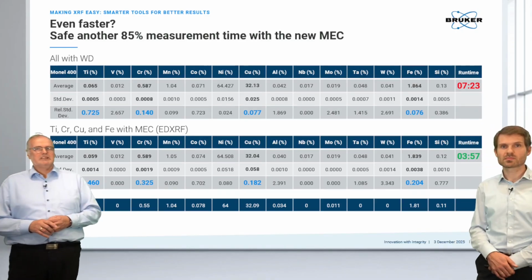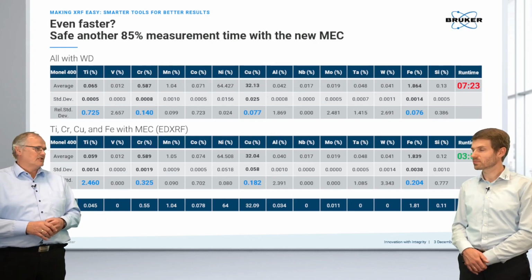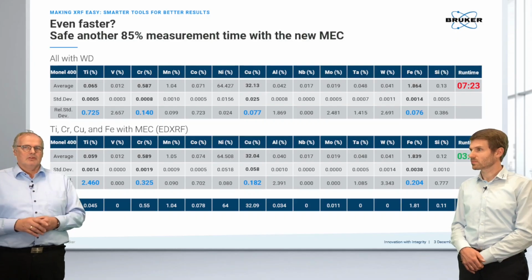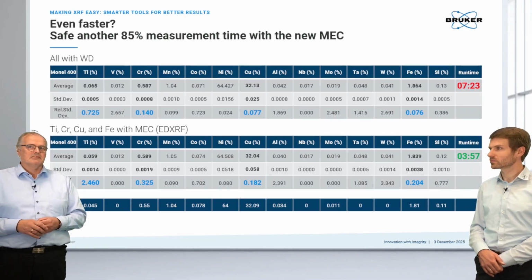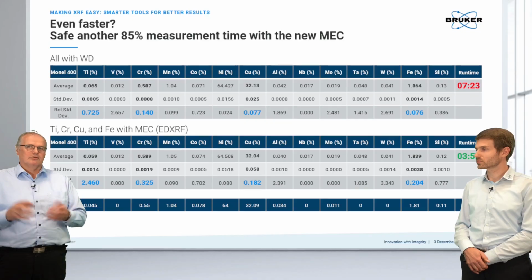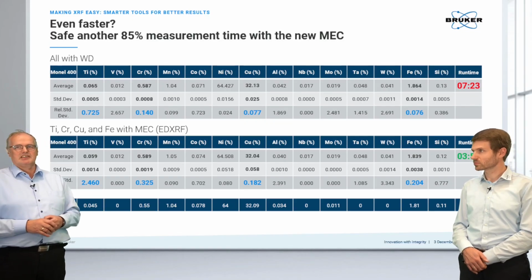So yeah, it's really a good way to enhance the productivity of an instrument using latest software, using new functionality and new hardware, which helps it to be more flexible. But also, just to remind you, it also is making the setup of calibration much easier.